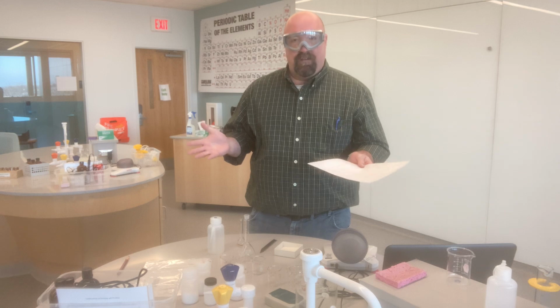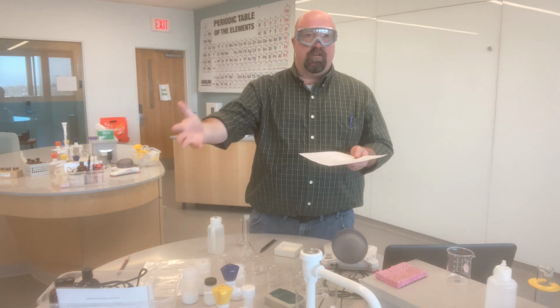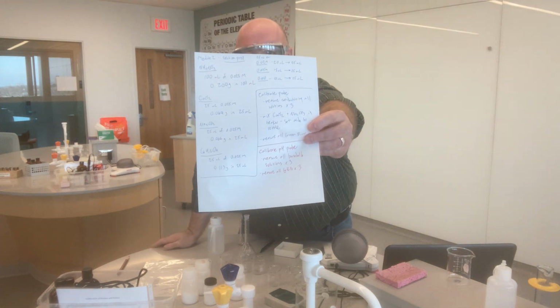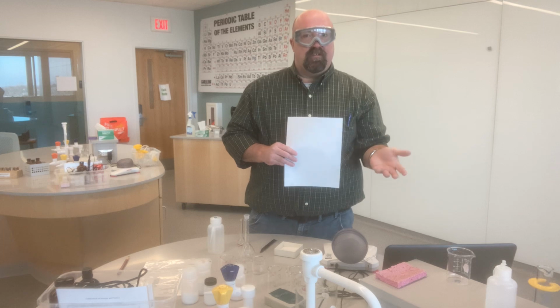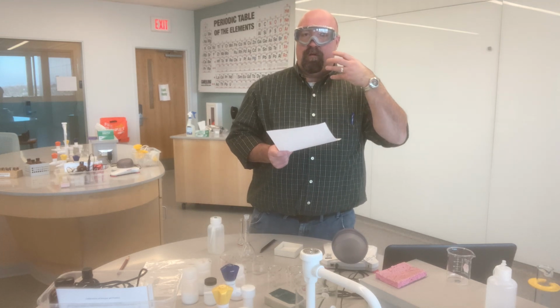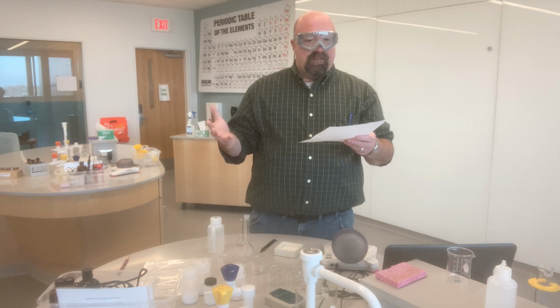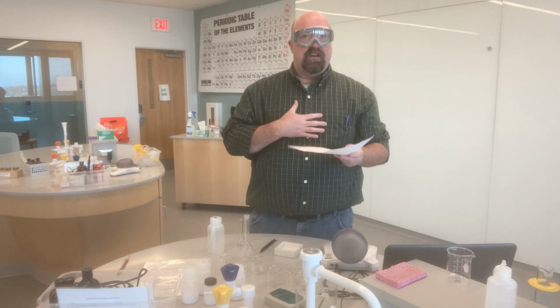This pH and conductivity lab is one that I've been performing for years. I've been watching students perform it for years. But in order to come in and go through my procedure today, I still made a sheet of everything that I'm going to be doing. Yes, I could flip through the procedure in the manual, but that procedure doesn't tell me the amount of grams that I'm going to need in order to make my solutions, and it's flipping through a whole bunch of different pages. And so what I was able to do was to take that procedure and condense it into one page of something that I can use.